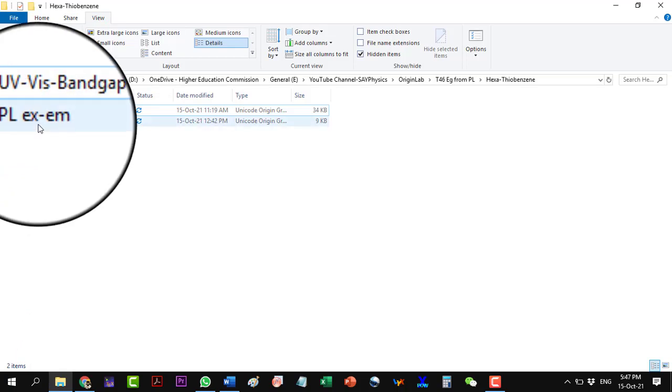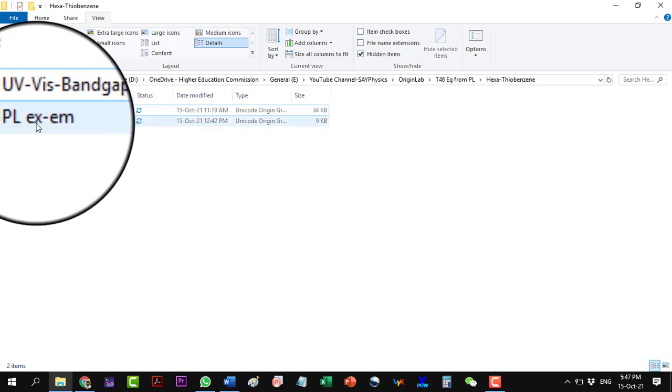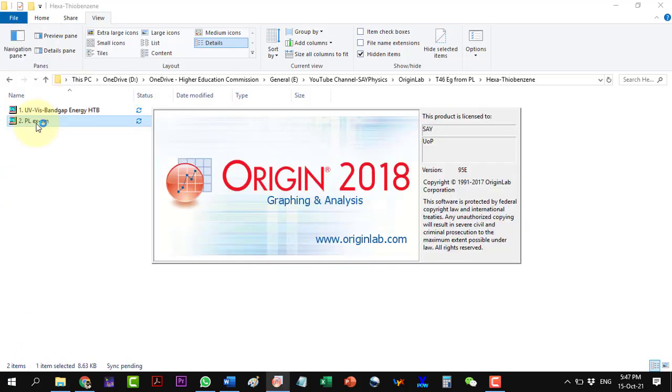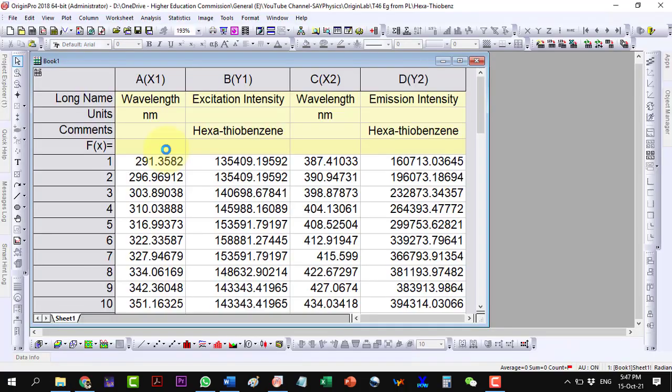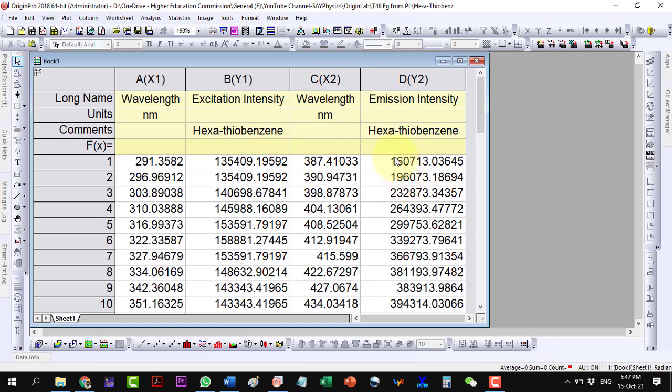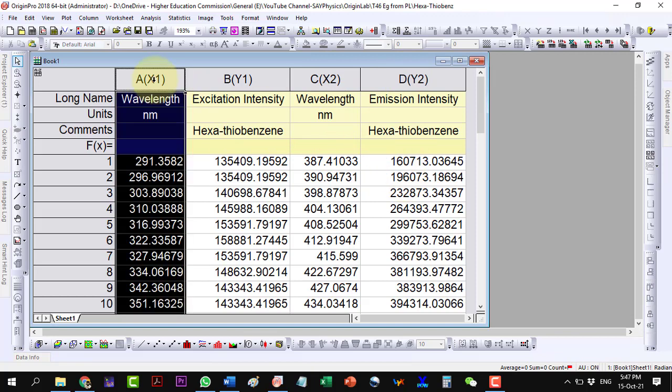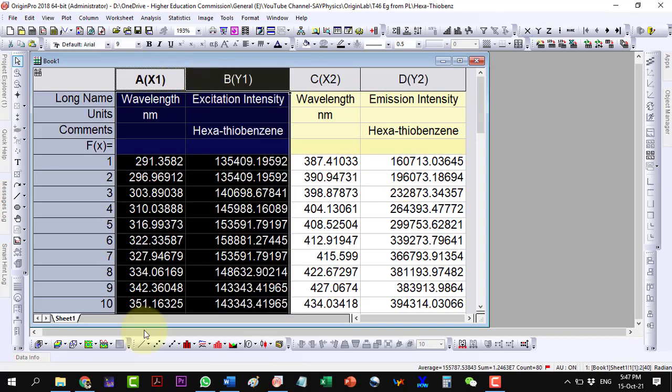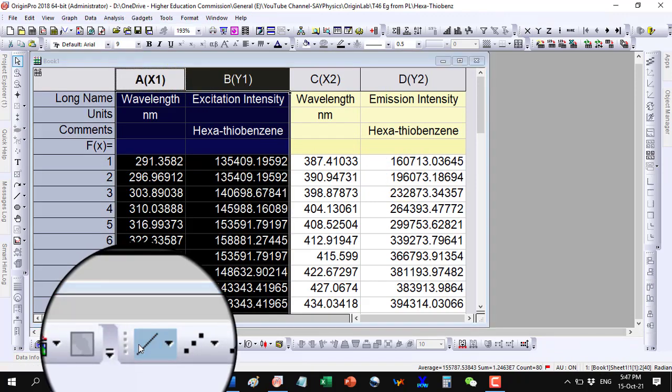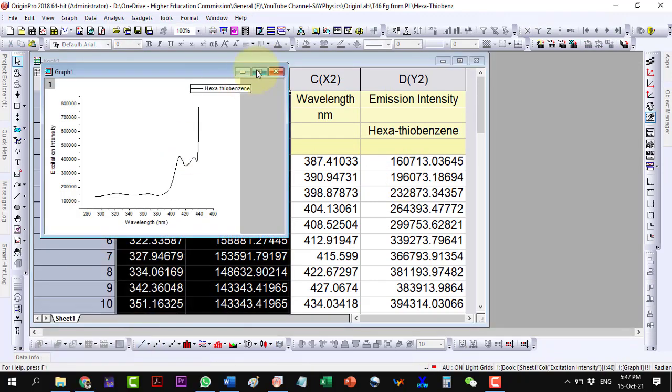Now, let us open the PL data. This is the PL excitation and this is the PL emission data. Plot the data individually for the excitation and emission.